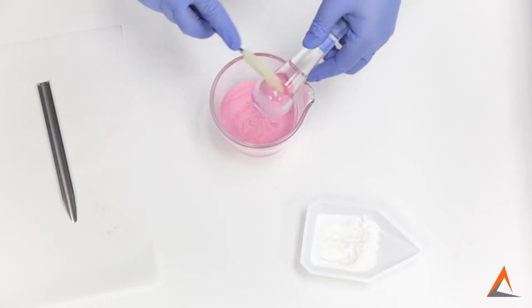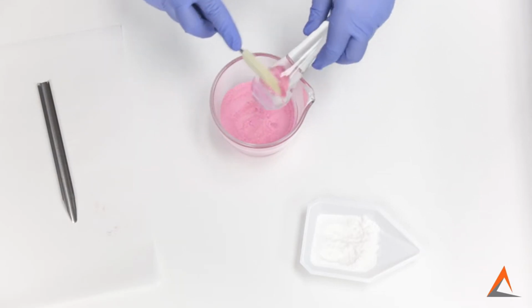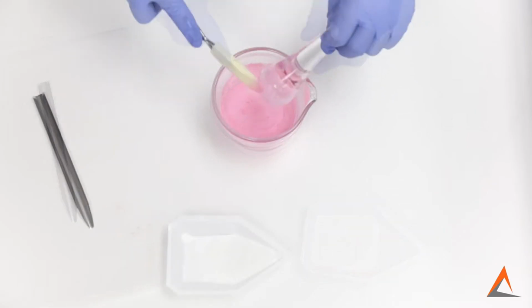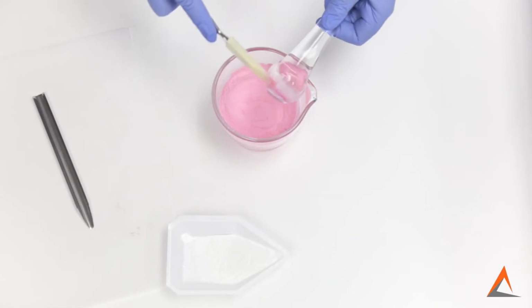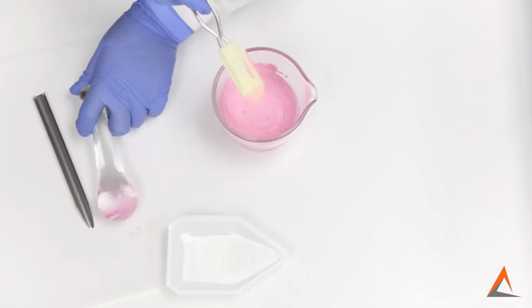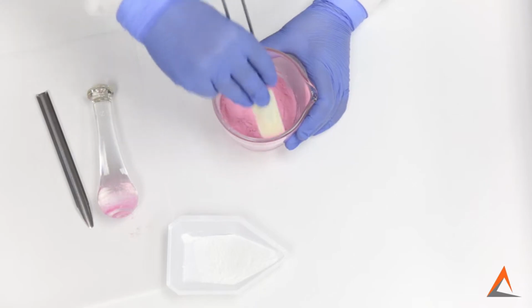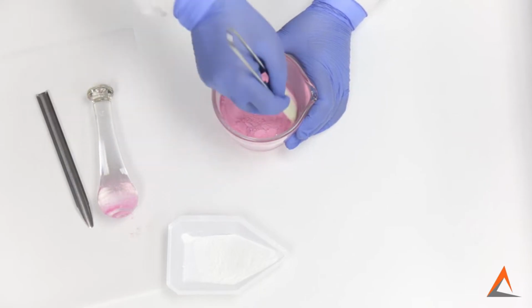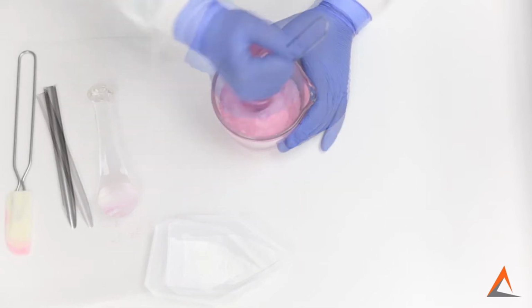You'll see with each addition of the larger quantity of powder, we have a fainter and fainter color. We use that red dye as the ingredient of the smallest quantity, so we can visually inspect the powder blend and the geometric dilution process occurring. Now that we have approximately equal quantities, let's take our pestle and triturate.